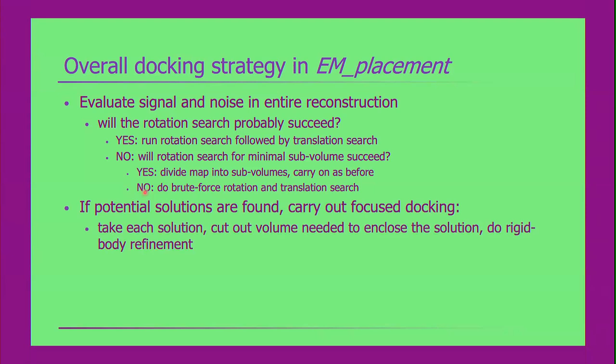If potential solutions are found, then in order to put them all on a common footing, it does what we call focus docking, where you just cut out the sphere that's big enough to contain your placed model and calculate the likelihood score with a rigid body refinement.